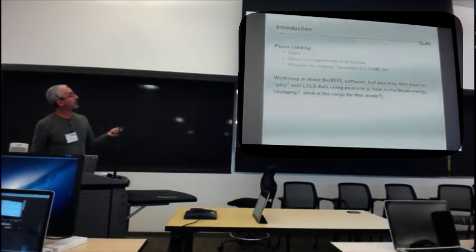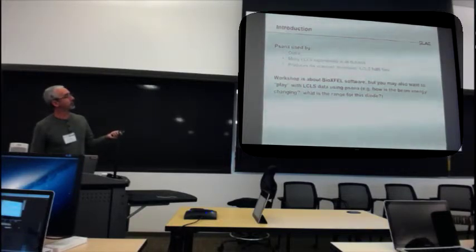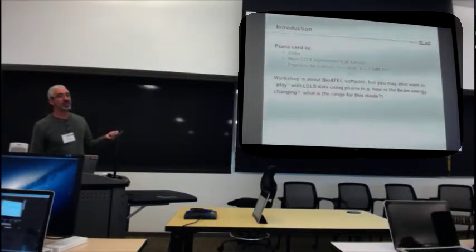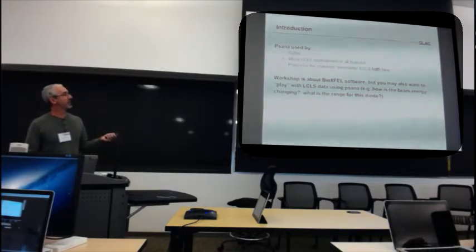It's used by CCTBX and many LCLS experiments in all hutches, because we support every detector and every experiment. Some people use MATLAB analysis on HDF5 files produced by LCLS. Psana also produces those HDF5 files, a standard format some people call translated HDF5 files. But these aren't as real time, which is a problem, because you really need real-time feedback in many experiments. This workshop is about BioXFEL software, but I think you may also want to play with LCLS data using Psana.